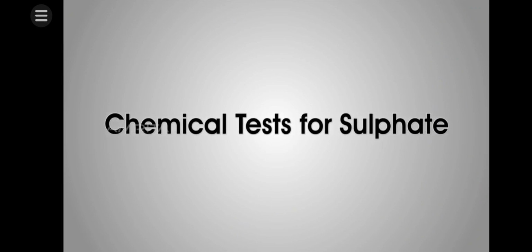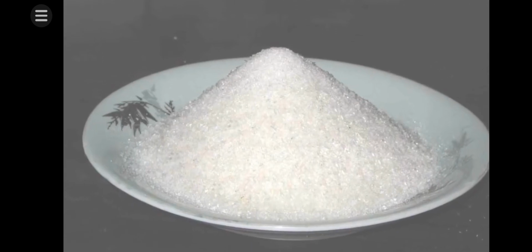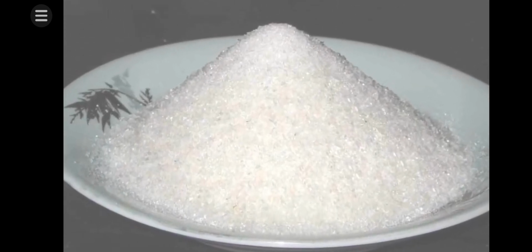Tests for sulphate. Sulphates are inorganic salts containing sulfate ions.